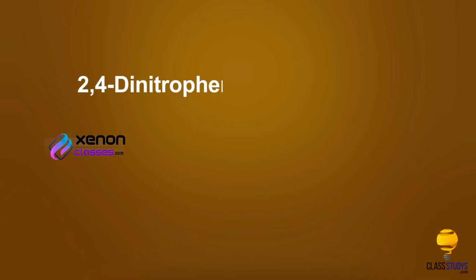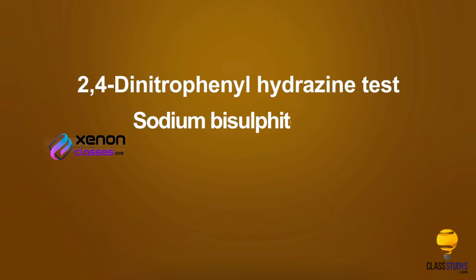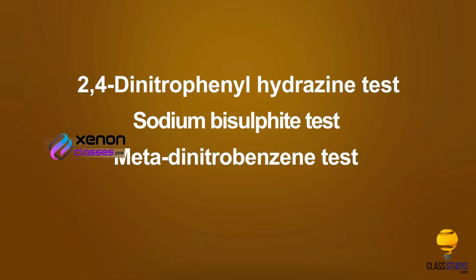They are 2,4-dinitrophenylhydrazine test, sodium bisulfite test, meta-dinitrobenzene test, sodium nitroprusside test.